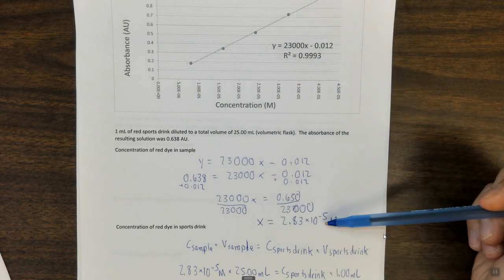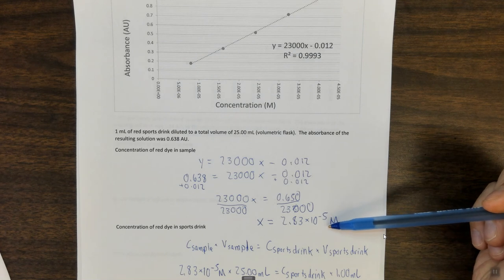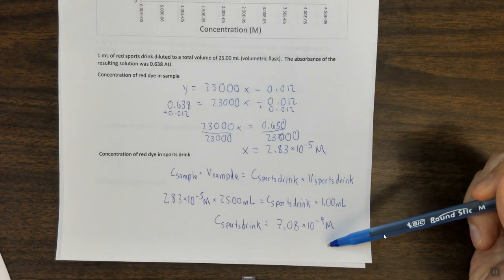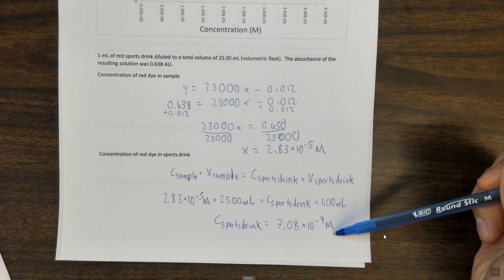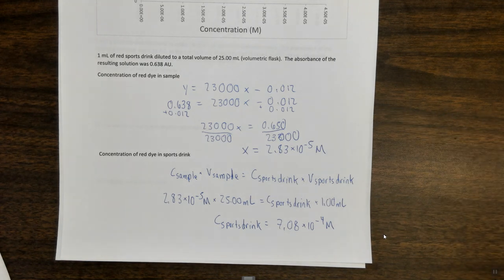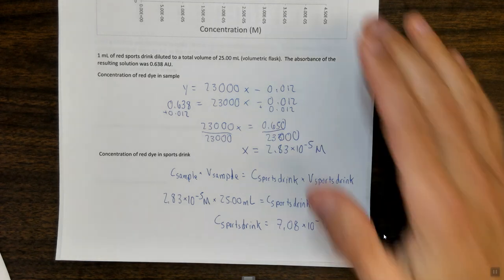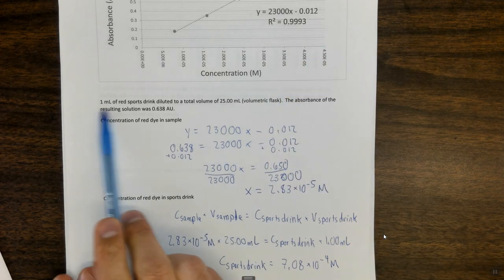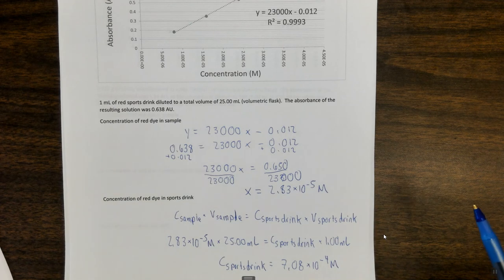Then we find the concentration of the red dye in that sample. We use the dilution equation to then find the original concentration in the sports drink. You use Excel to do this math because it'll be easier since you have to do it 3 times. You calculate the average, the standard deviation, and the relative standard deviation, and you comment on the precision. That's basically what you're going to do. The last thing that I want to point out is these volumes are made up for red dye, okay, and some made up sports drink. You are not using the same sports drink or whatever.